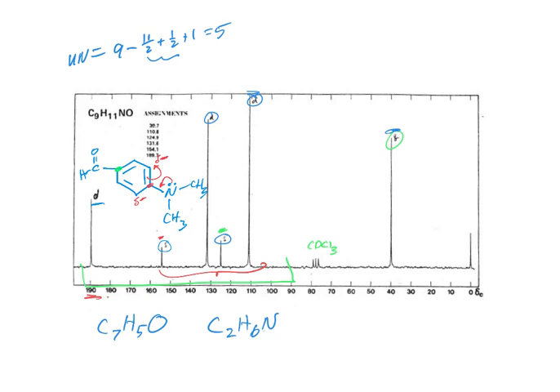The aldehyde itself is doing the opposite, right? So the amine is an electron donating group into the ring. The aldehyde is an electron withdrawing group. So this is going to create delta plus on these two positions. Okay? So out of those two protonated carbons, which is the one that should be the most upfield? Near the aldehyde? Upfield is near the... Yeah, so this one here I'm at 110.